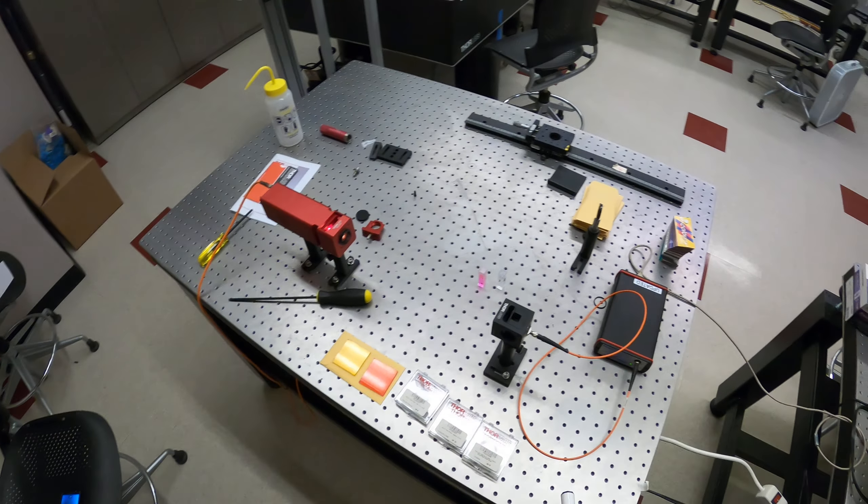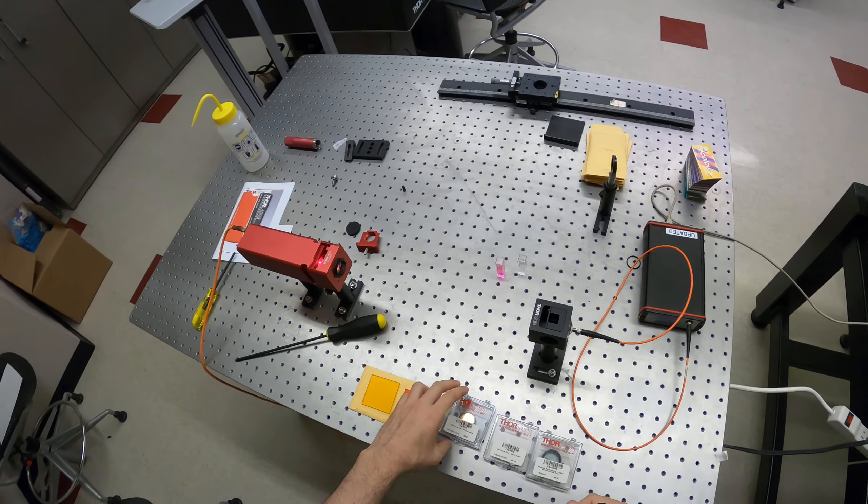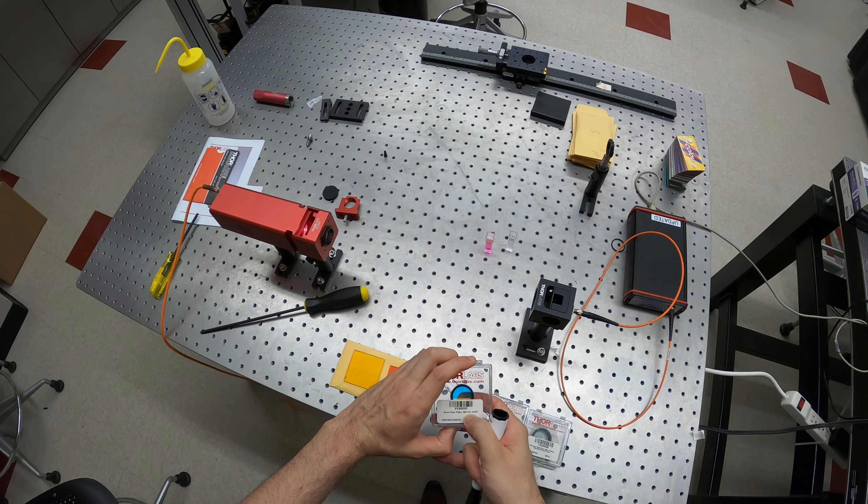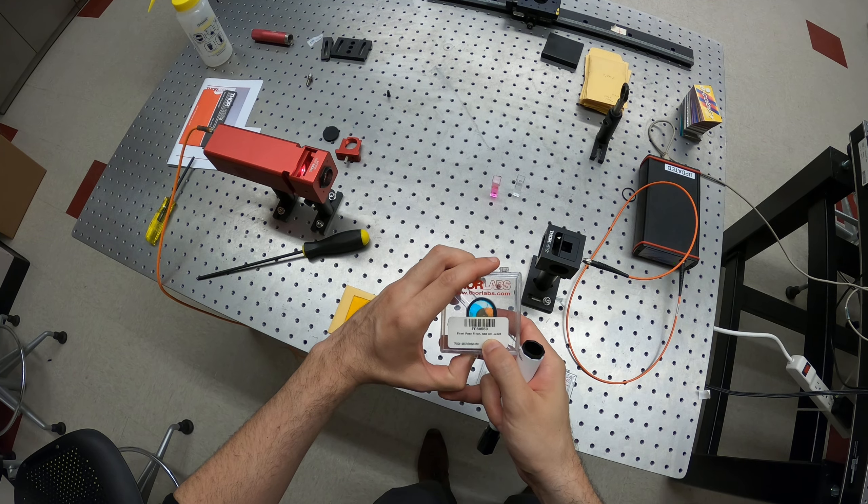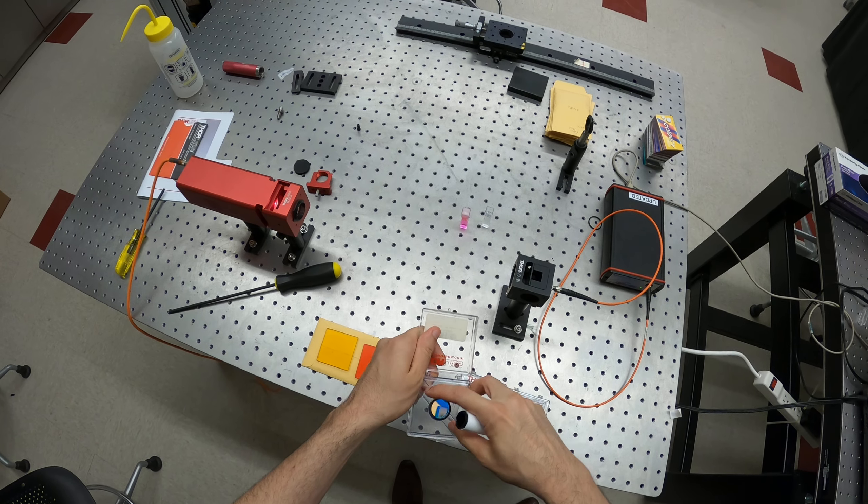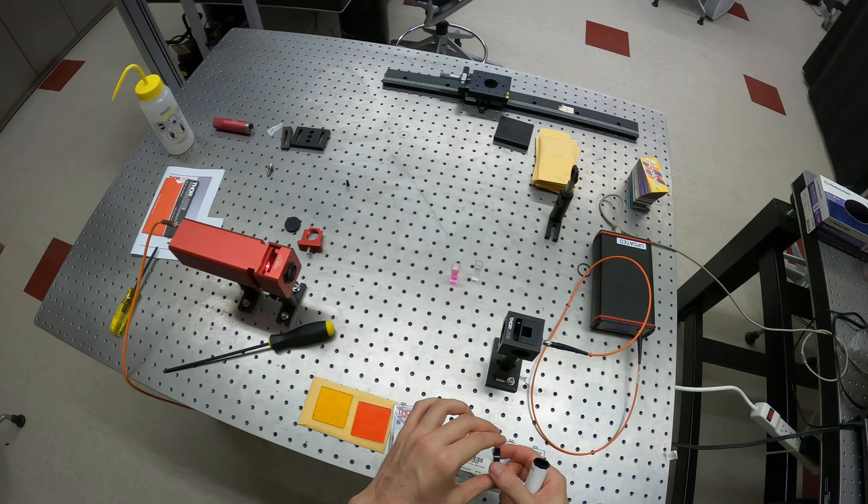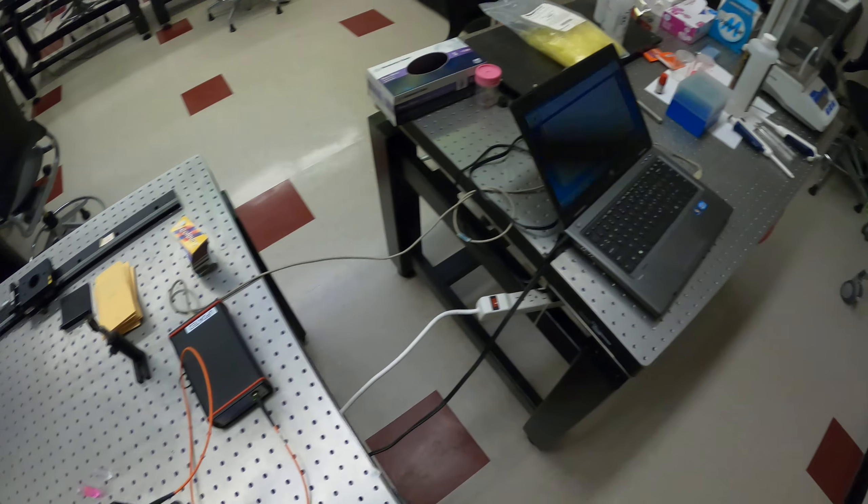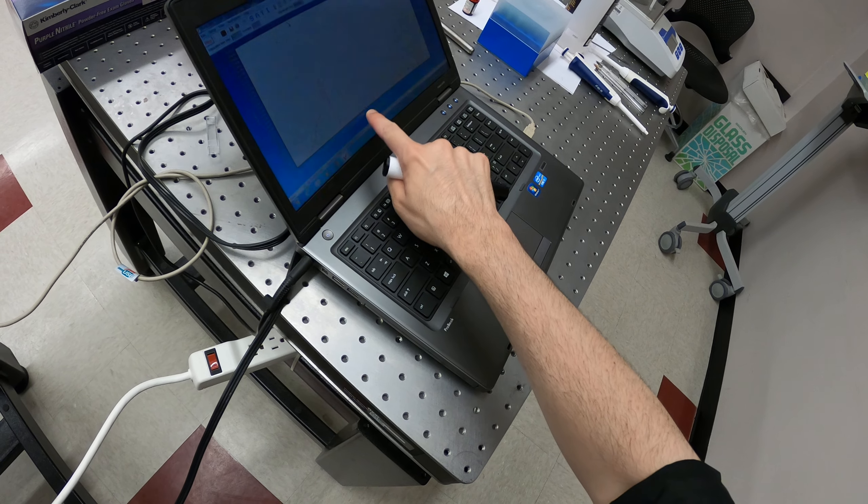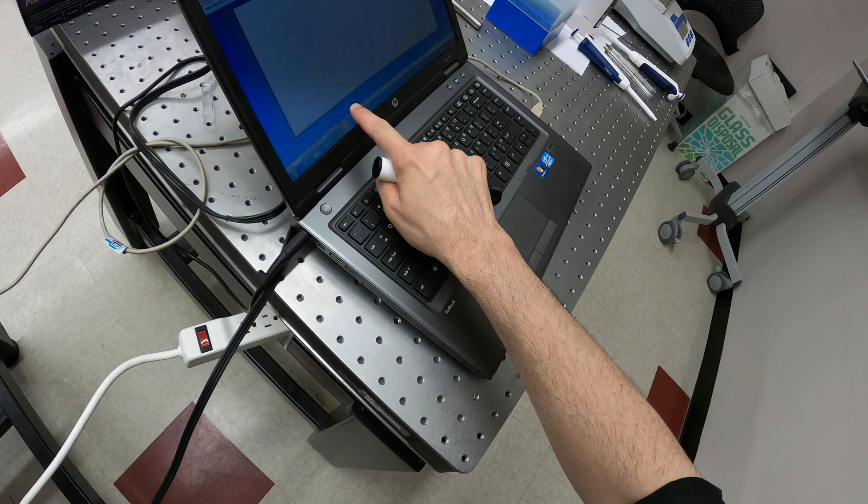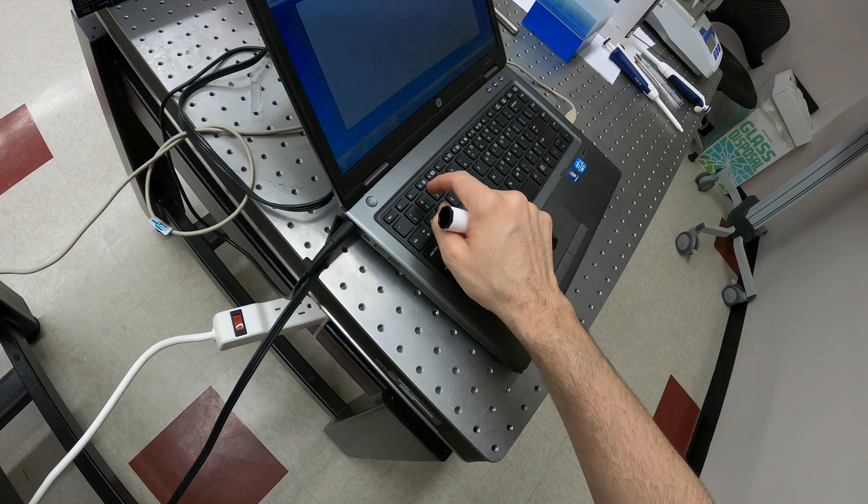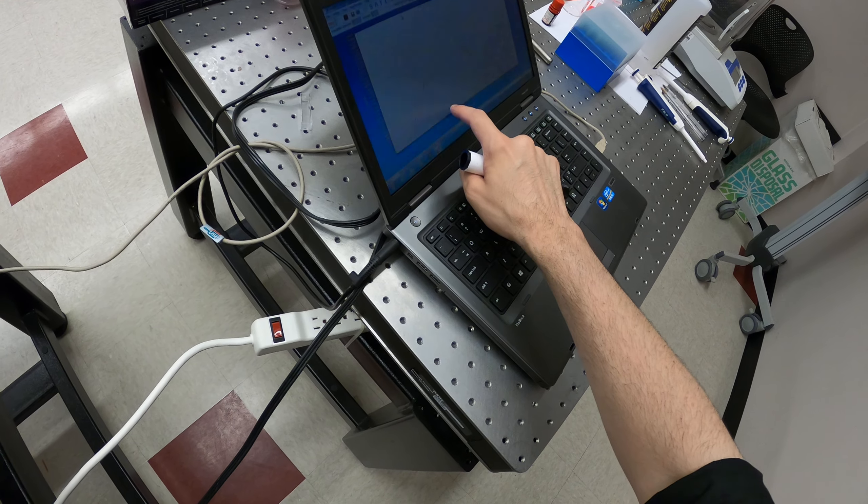These filters are widely used in fluorescence spectroscopy. This is a short pass filter with a cutoff of 550 nanometers. I can block here, and I can see that light is being blocked in this region from 550 onwards. This is orange.